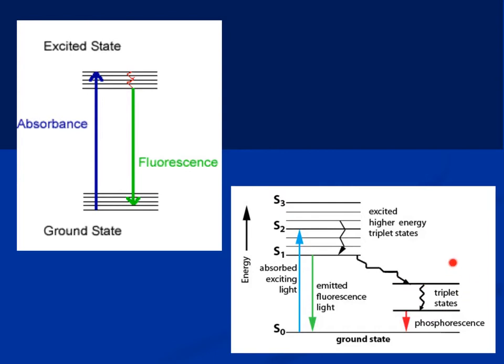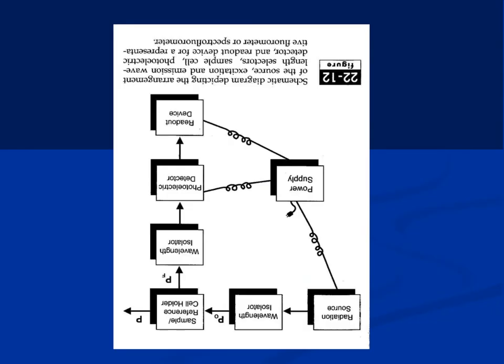So if it stays like that, it can hold the light for a longer time, and phosphorus shows this light being emitted at night, and that's what is called phosphorescence, which I told you before. So there are fluorescence and phosphorescence, two kinds of processes which can happen in emission spectroscopy. That's what we are determining here. They're more sensitive and help to determine the concentration of the solution.